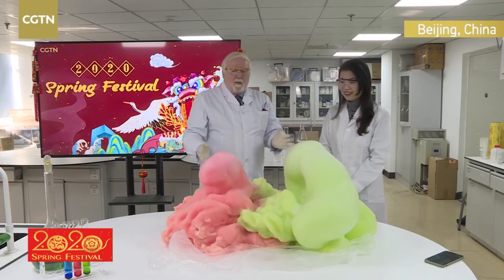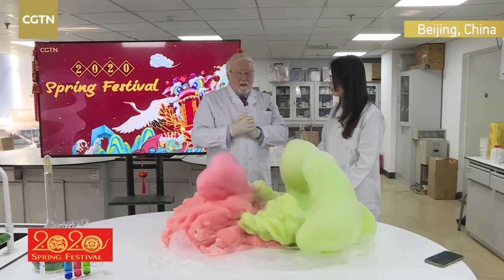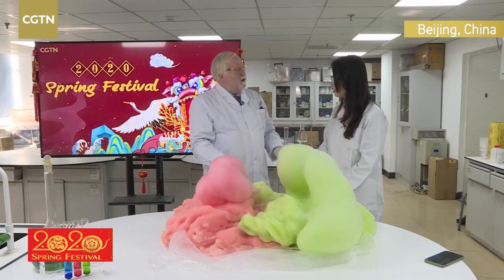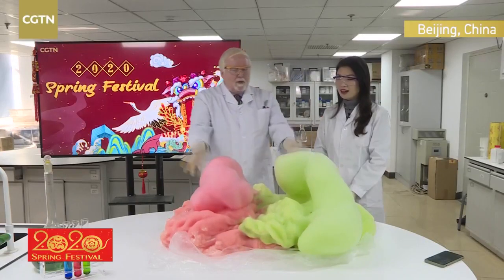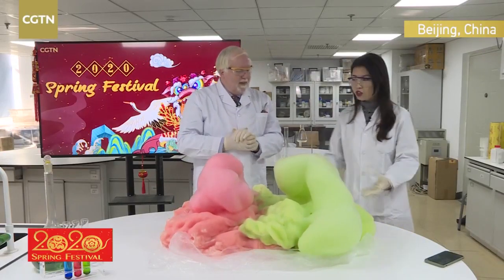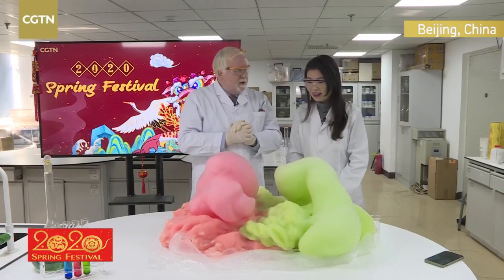So why is the effect different? The chemistry is the same as the first reaction, but the effect is different because we've got the washing up liquid. So the steam and the oxygen blow all of these bubbles, blow all of this foam. It reacts so fast with all the catalyst added. So catalysts can have a dramatic effect.